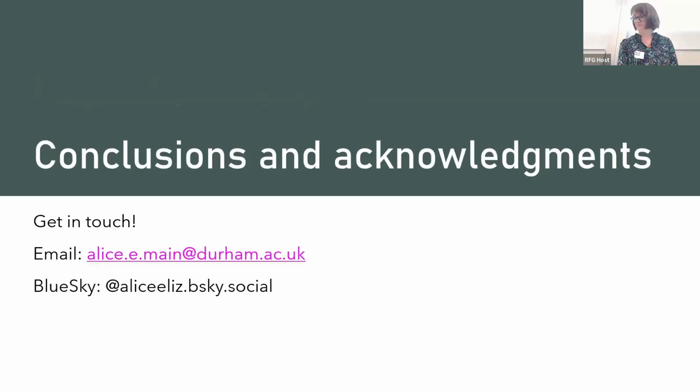So, to conclude, this paper can be seen as a brief outline of the work I'm currently undertaking as part of my MA dissertation. This methodology, although well used in heavy industry and the study of ceramics, is new to the field of ancient glassware, and the combination of XRF and ICP will hopefully allow me to explore some of the questions I have regarding socioeconomic differences between fort and extramural settlement, and the potential of glass as proxy for understanding trade in a similar manner to numismatics or Samianware.